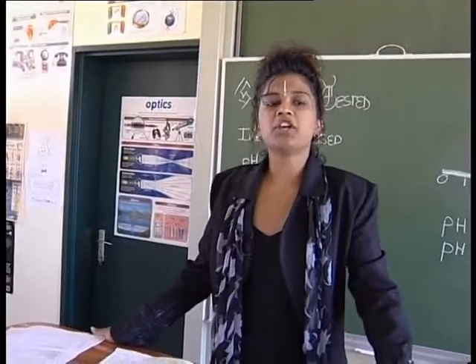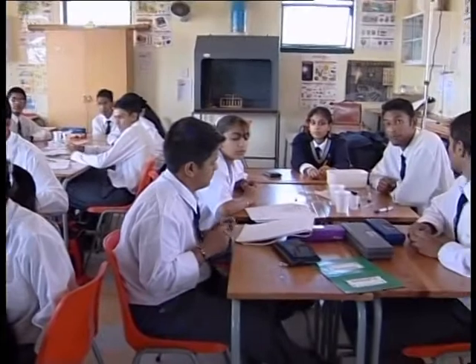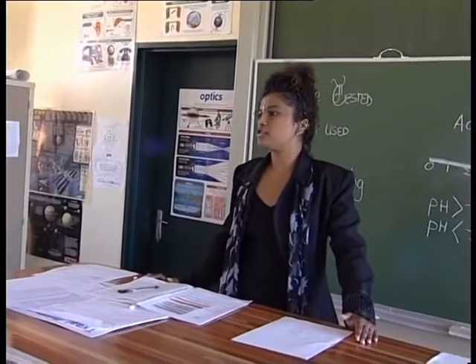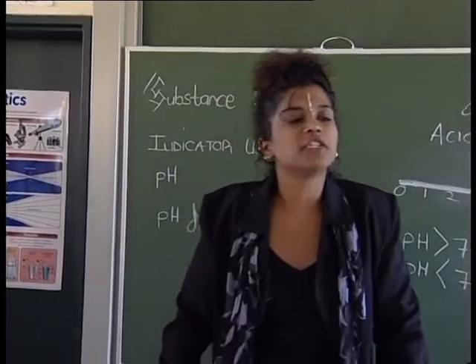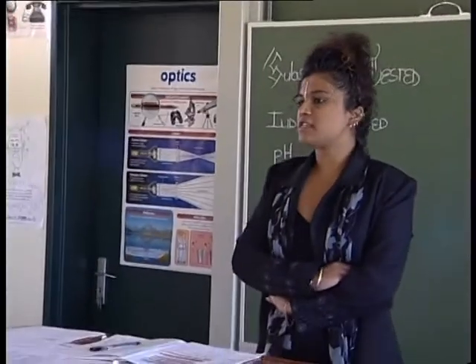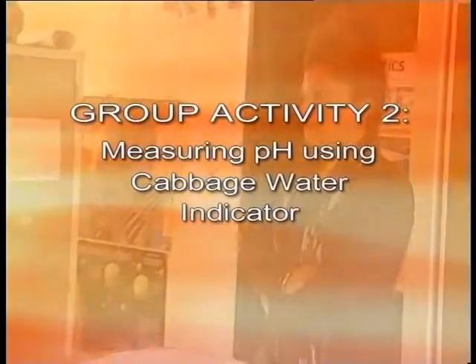A1. Right, which is your least acidic solution in your combo plate? A7 and? Very good. A7 and B7. Who can tell me what is the pH of distilled water? Distilled water is neutral, so it's 7. What factors do you think the pH of a solution depends on? The concentration of the liquid. Firstly, nature of the substance of a solution and concentration of a solution.